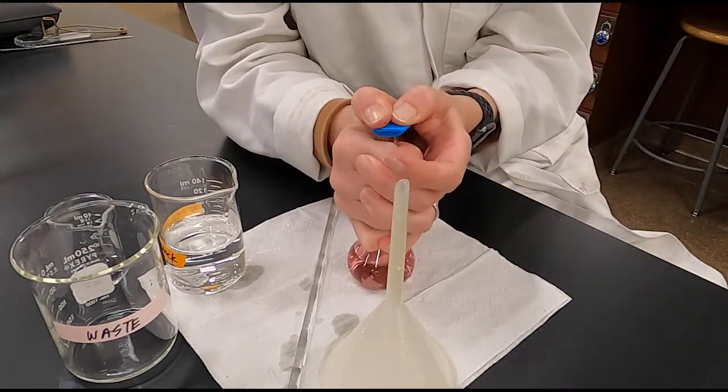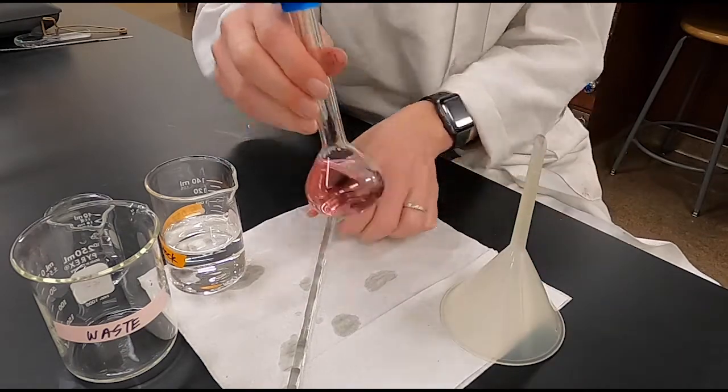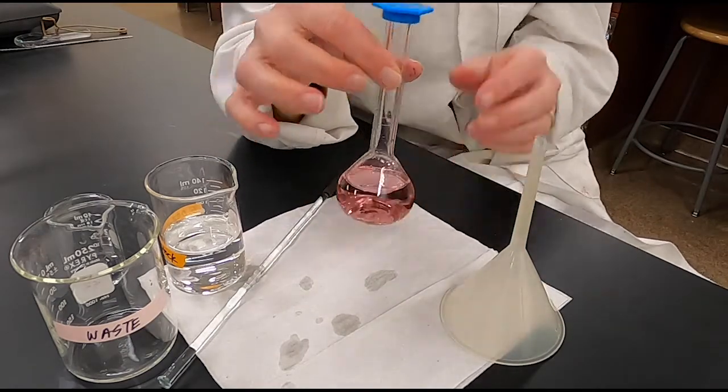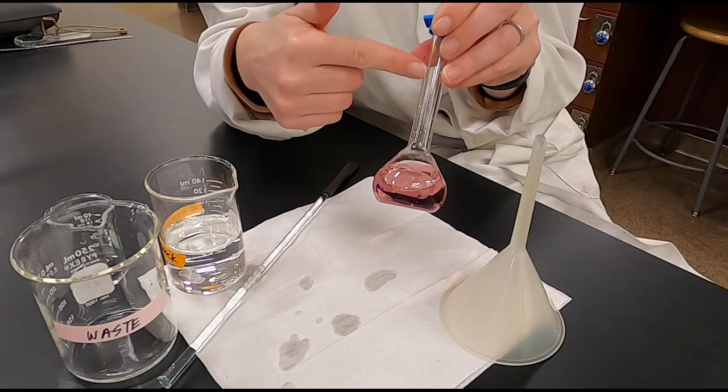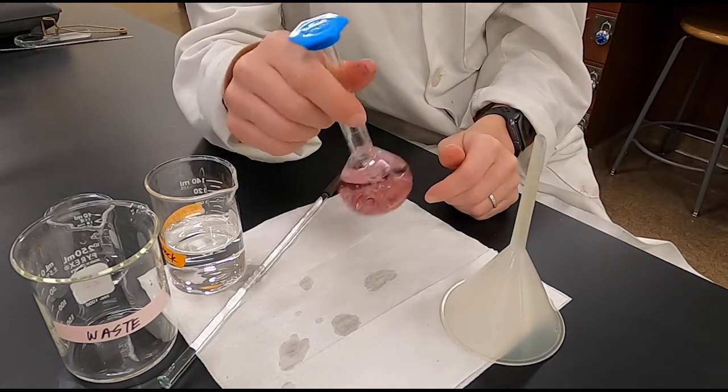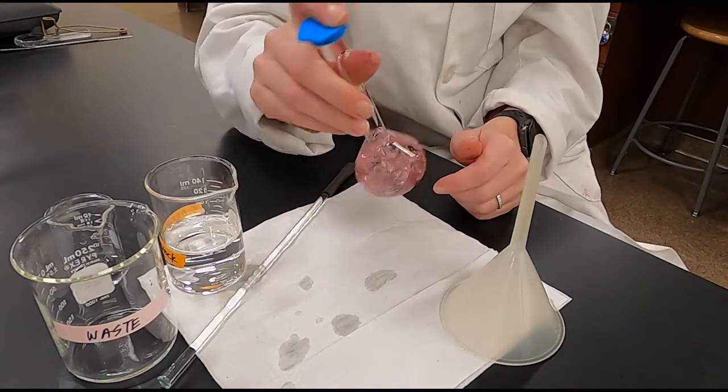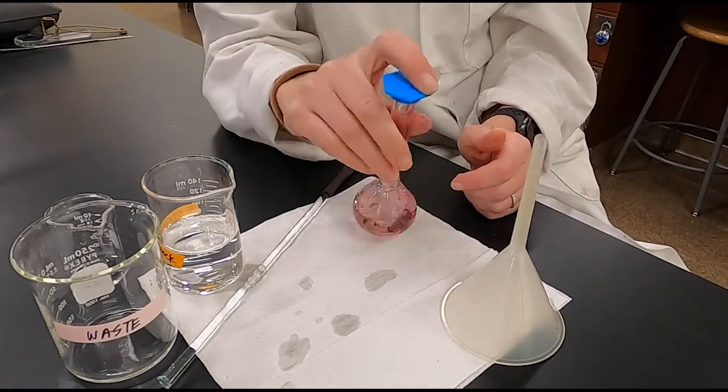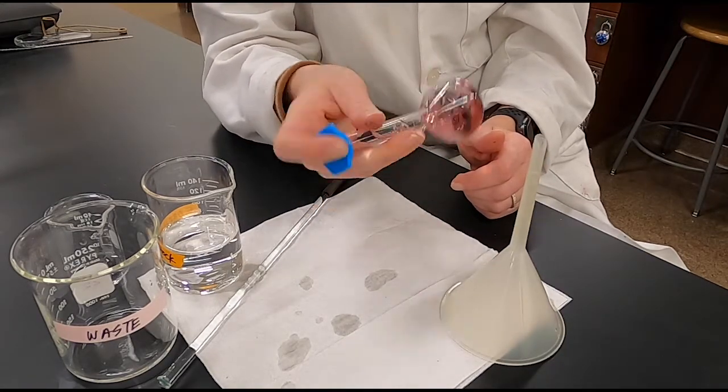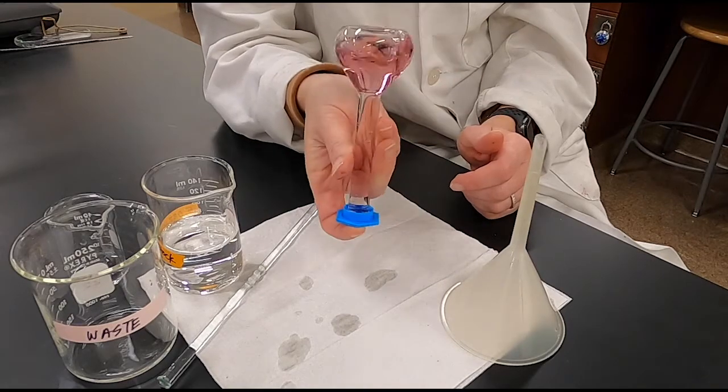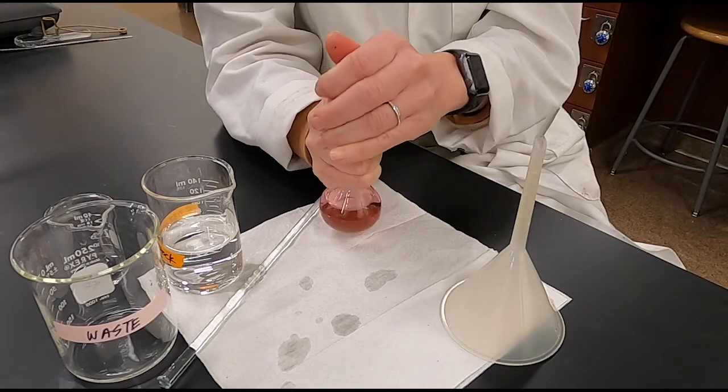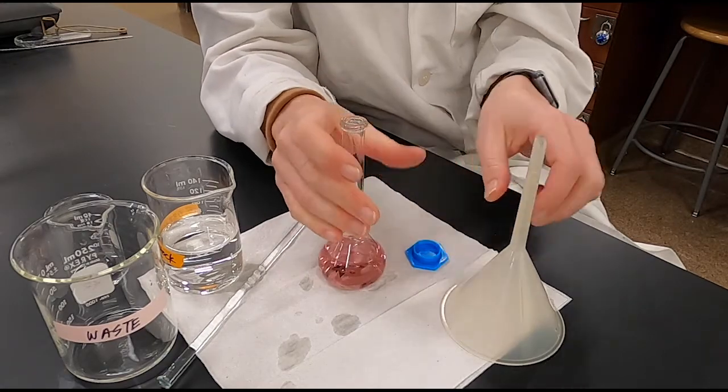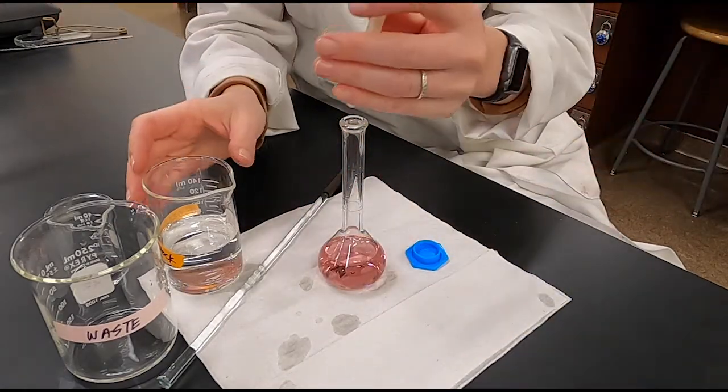Remember that when you prepare a solution, you want to mix it when it's still only partially full. The narrow neck on the volumetric flask makes it difficult to mix thoroughly if you start by filling it to that mark. So mix it thoroughly when it's halfway full, and then you can continue to prepare your solution by adding more solvent.